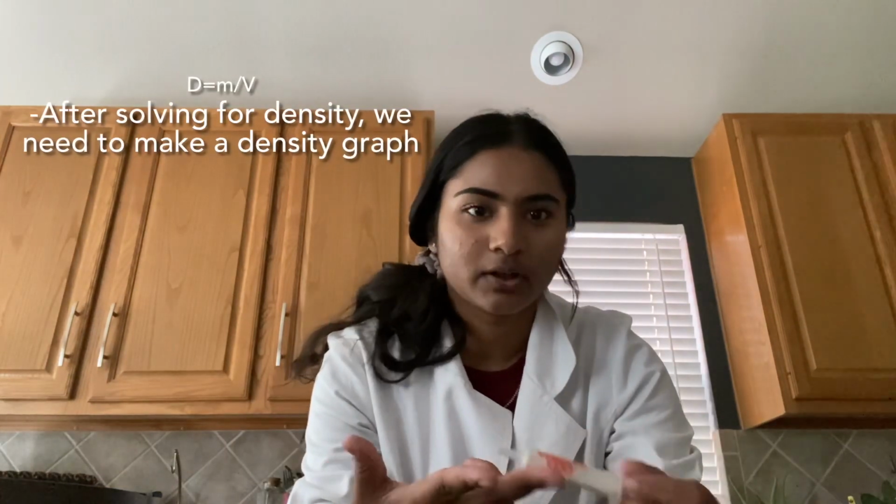Hi everyone, my name is Anne Samuel, and for my General Chemistry 1 lab, I'm going to be demonstrating calculating density and comparing the densities of water to each other. To figure out density, we need mass and volume, so I'll be finding the mass and volume of the two different temperatures of water and comparing the densities to each other.